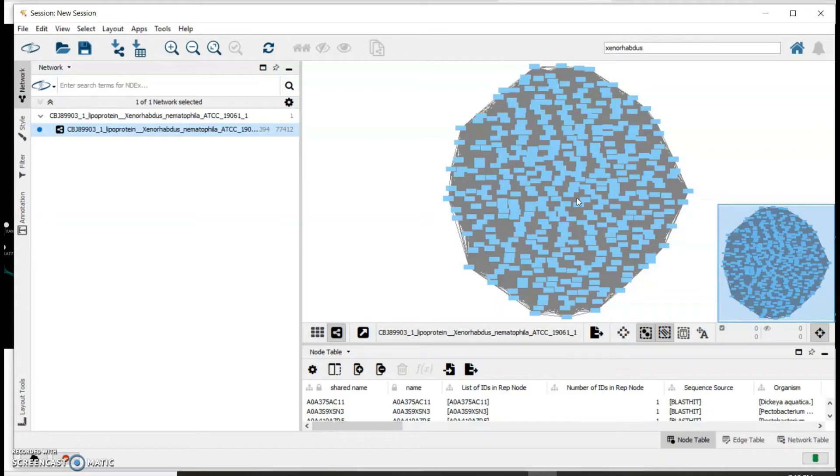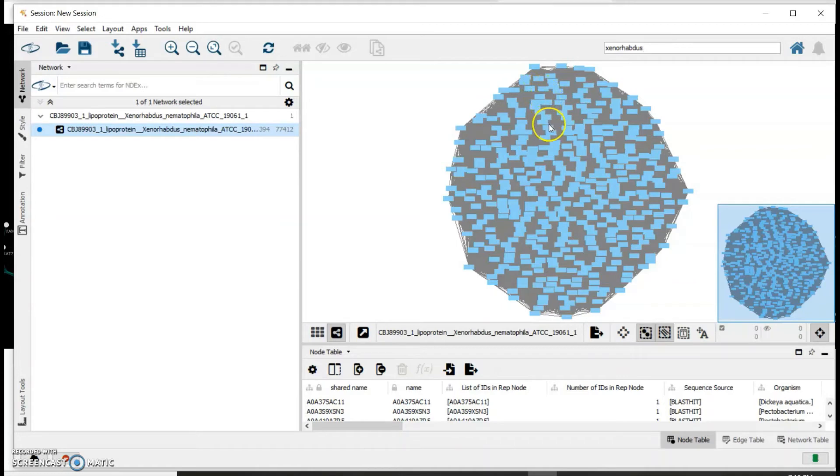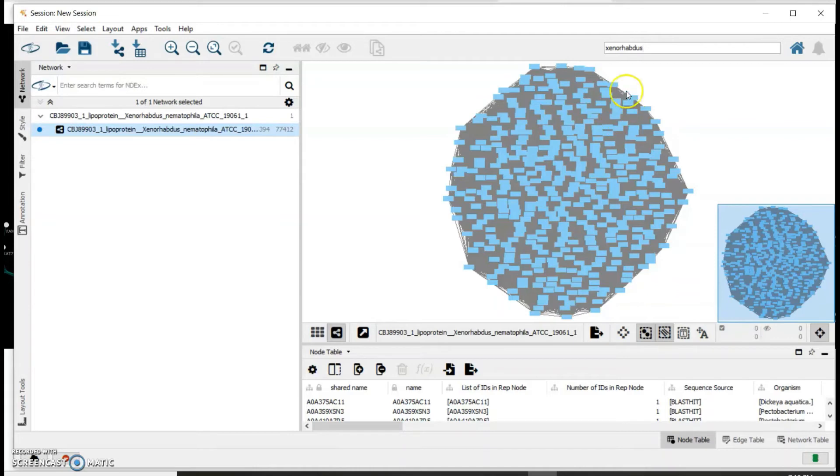In this network, the sequences are represented as nodes - that is these blue boxes - while they are connected by lines or edges if they meet the alignment score you initially set. In my initial network you can see that everything is connected to each other.